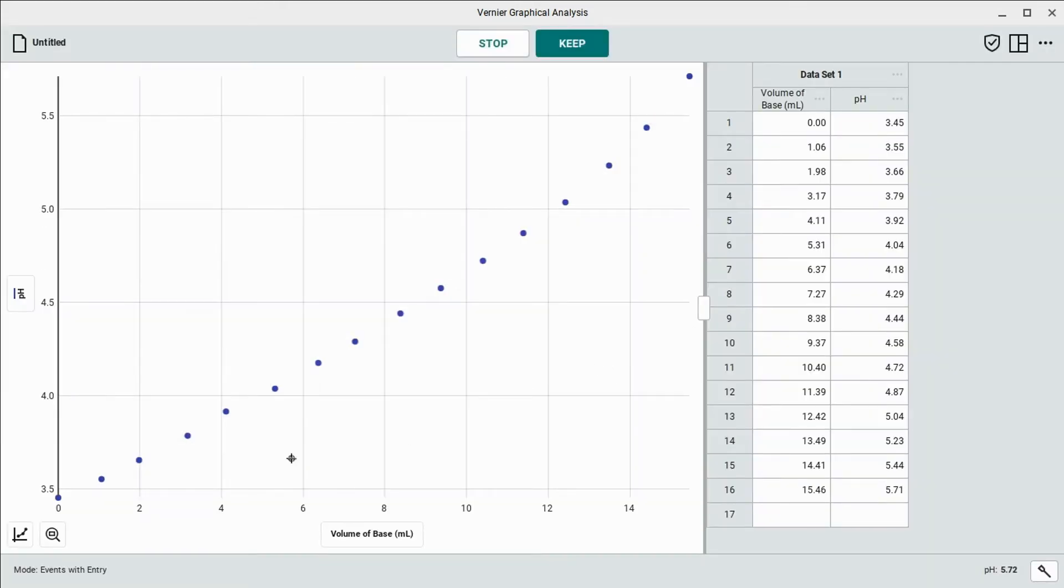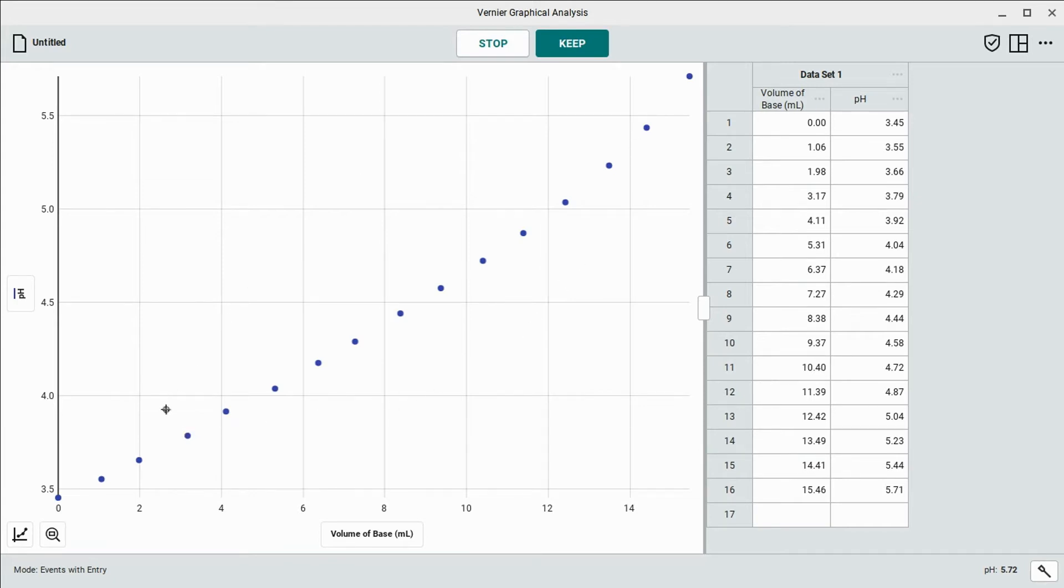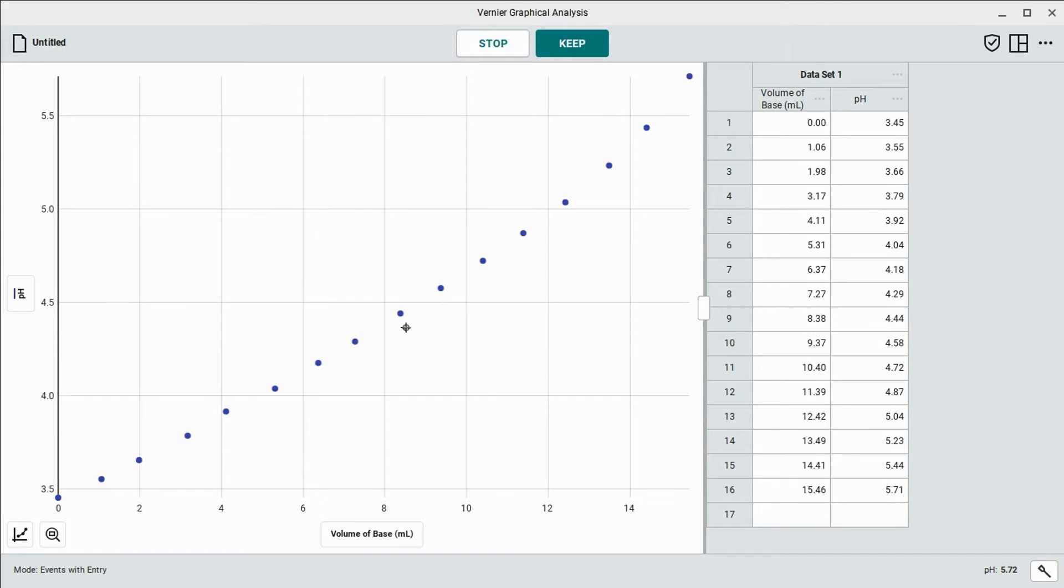Hopefully you can see here on the graph that the pH levels are rising slightly more per milliliter that we've been adding because we've been trying to keep it relatively consistent. The curve has started to increase a little bit, going a little bit higher. So we're going to start slowing down a little bit, maybe going a little bit less than a milliliter, probably not too much below half a milliliter at a time.